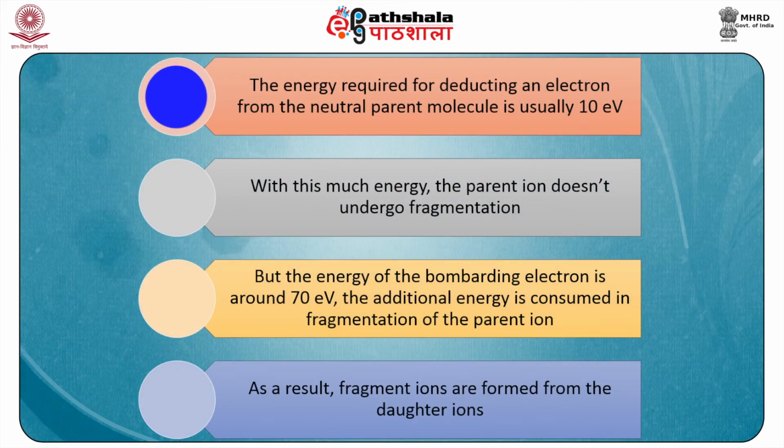Now the energy required, students, for removing an electron from the neutral parent molecule is usually 8 to 15 electron volts, and this value is often referred to as the ionization potential or the ionization energy of a particular compound.